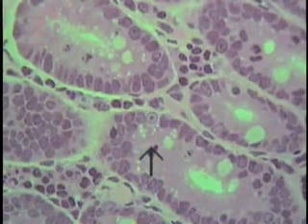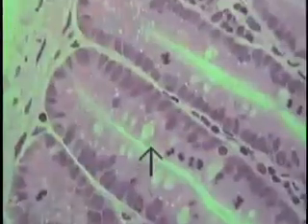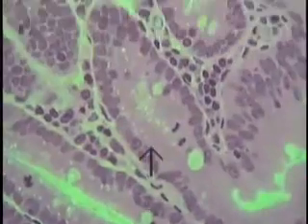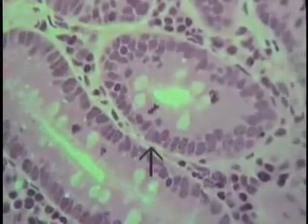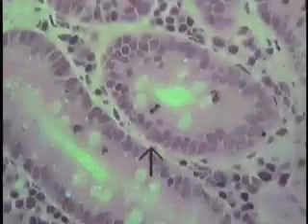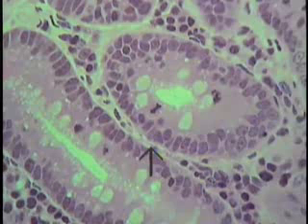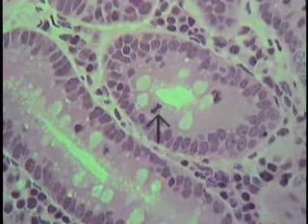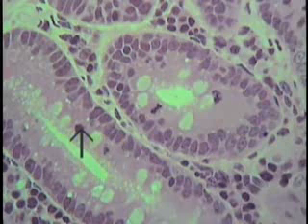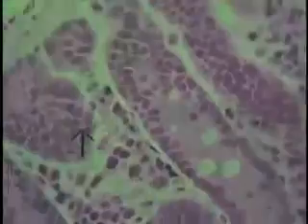So this is the position or the place to look for these mitotic figures because of the extraordinary number within these simple tubular intestinal glands. One should familiarize oneself with recognizing, first of all, mitotic figures, and if possible, put an identification on each one of these mitotic figures. There's a mitotic figure here, one here, one here, one here, as seen in these simple tubular glands.